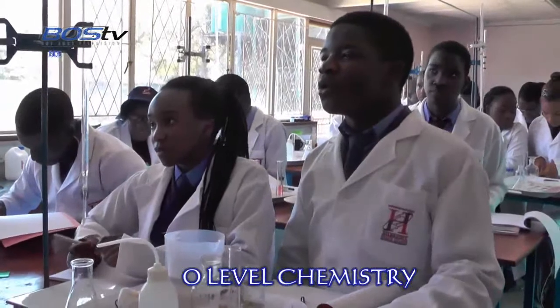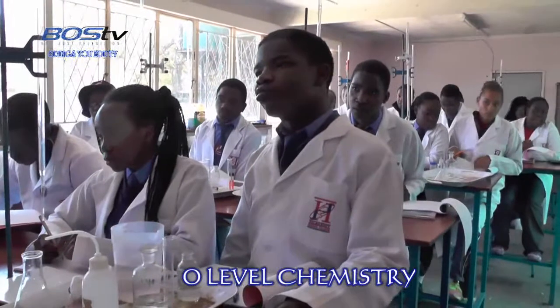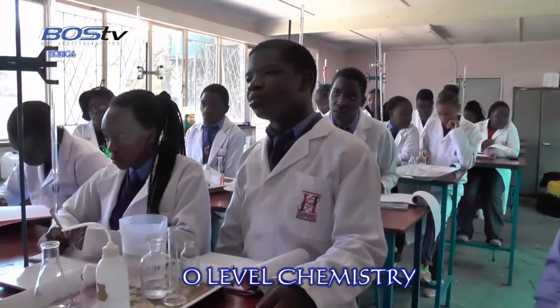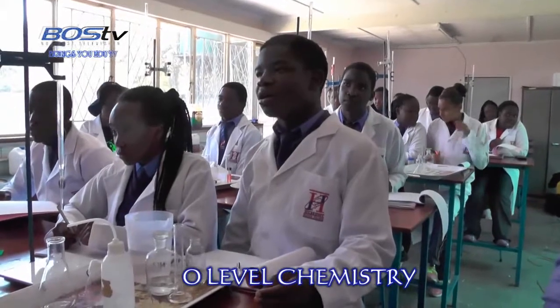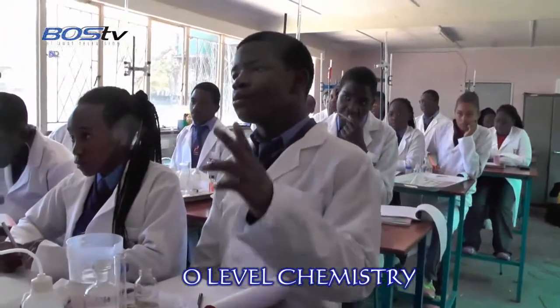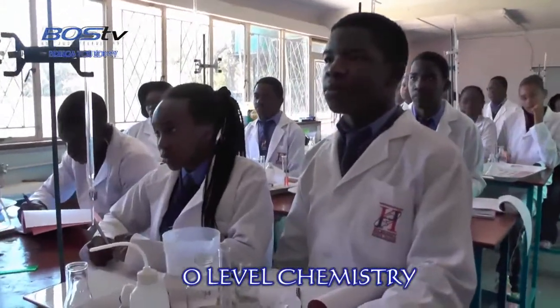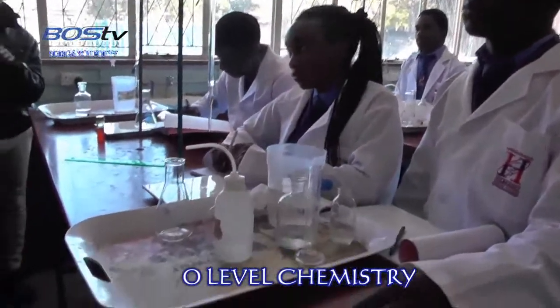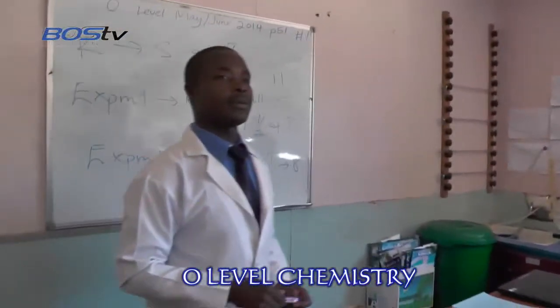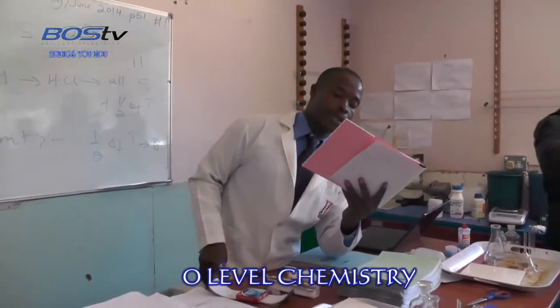Okay, maybe take it this way. If half of T for the second part required 8, how much is required by half of T for the first part? It's still 8. Now, if the first part requires 8 for T, and the total of T and S required 11, how much is required for S? Yes, 3. And how do we get that? 11 minus 8. So it's the value of your first endpoint minus the value of the second endpoint. You get it? Okay, let's proceed. Write that down and proceed.